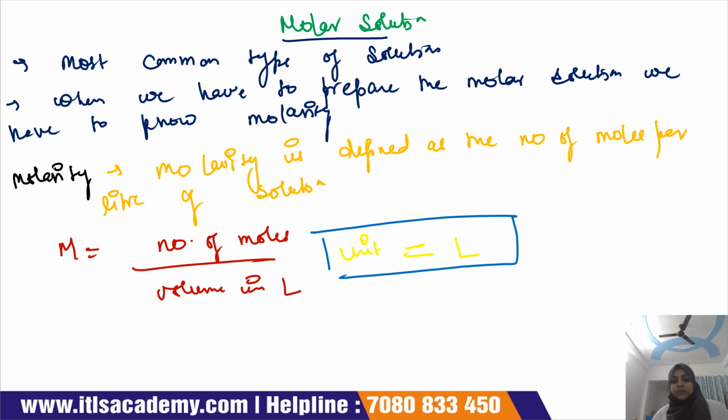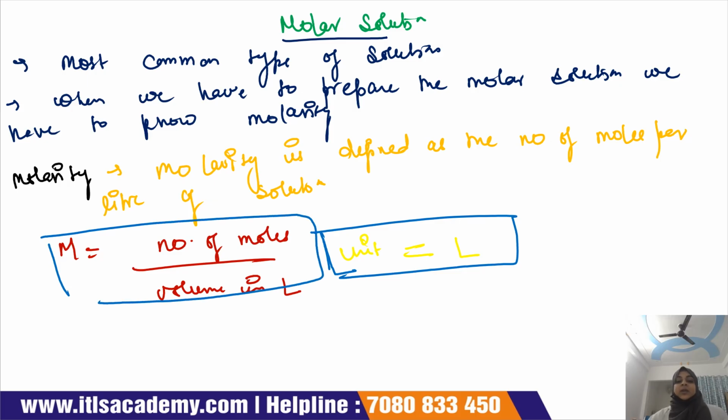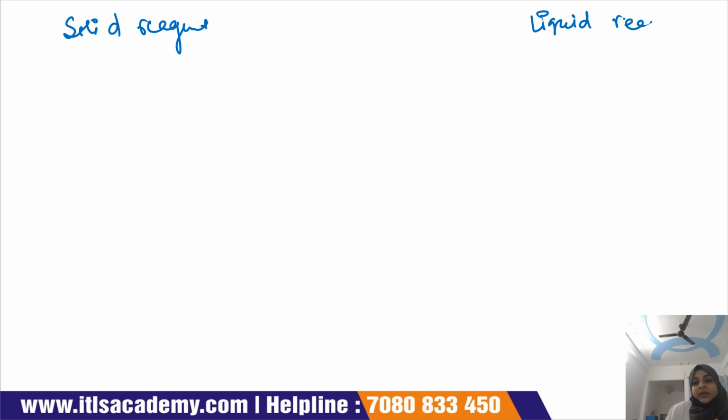Now this is about the molarity, and this formula is for molarity. So for the calculation of the molar solution, we calculate it in two ways. One is for a solid reagent, and the next is for a liquid reagent.